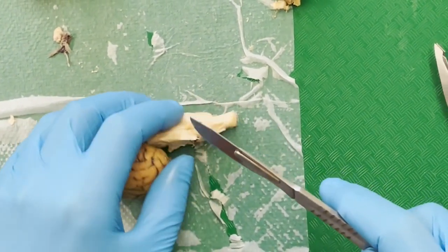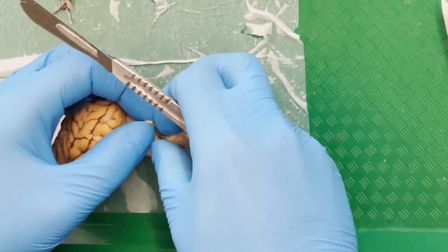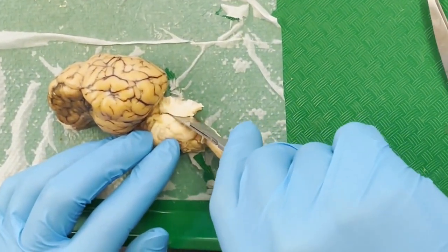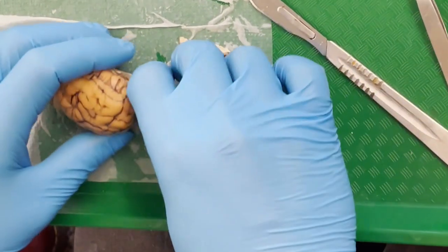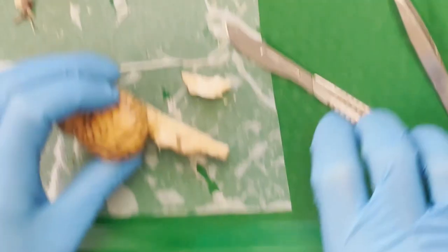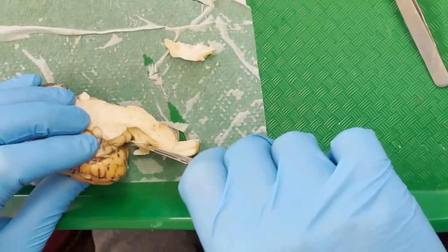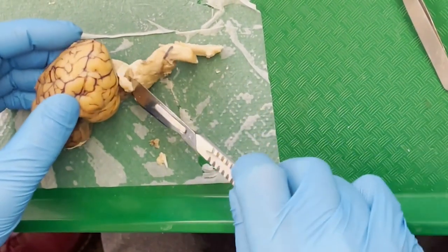So now when I flip it over, I can kind of flip it around and see where I can extract more stuff. Take this chunk out of the way here, look at it from the back a little bit, and I'm going to continue to cut into the cerebellum again, this time with a more vertical slice, just to remove this part here. And now I think if I pull back the chunk of the cerebellum underneath, we can start to expose the brainstem. So take off that chunk. We can cut just a slight bit of that off. Carefully, very carefully. Okay. That's good enough for me.